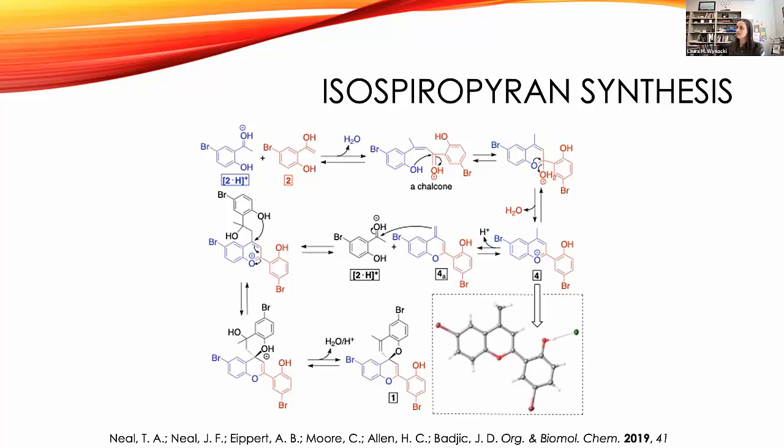So for students at the undergraduate level at this point, they can maybe do that first aldol condensation, but seeing how everything comes together is a little bit of a challenge for them. And I think it pushes them in this lab, which is exciting in a lot of ways, for them to see a little acid catalysis can get you some pretty complex molecules. And the molecule that I've shown here is just one structure. Under different conditions, we found in the lab that it's actually an interesting compound that can have different colors, which you'll see in a few moments here.